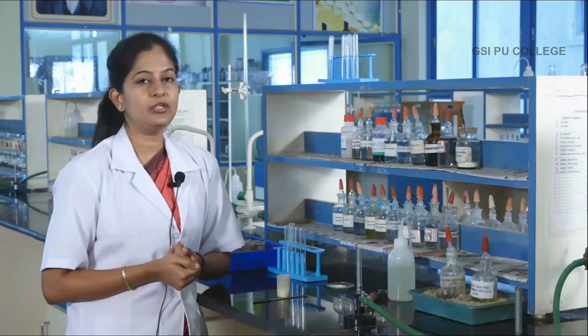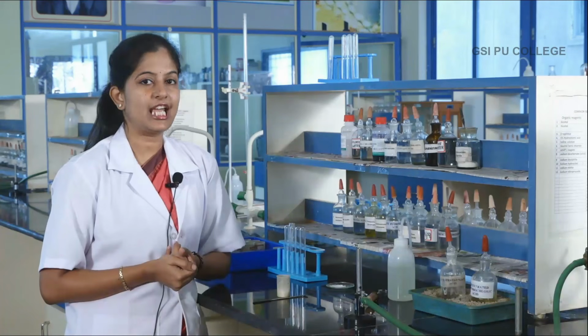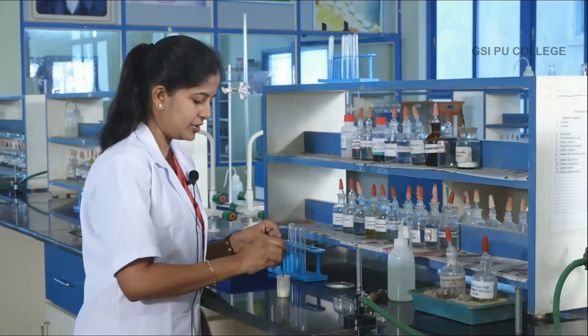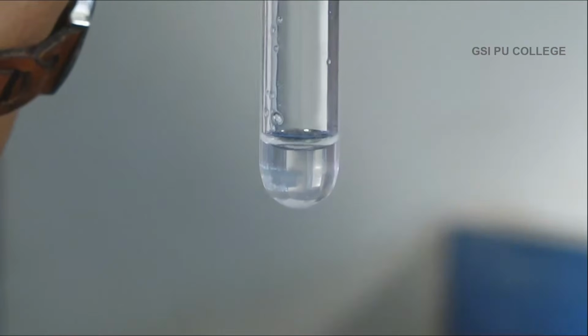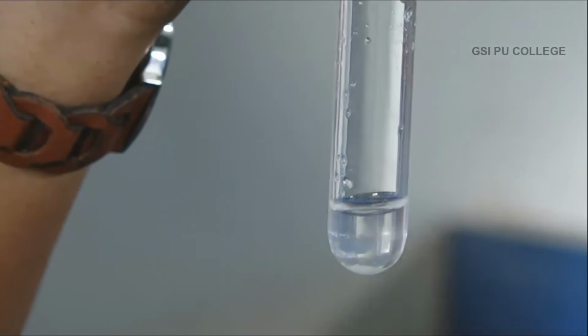Now we directly move into the analysis of acid radicals, that is, the first group acid radicals. The group reagent is dilute HCl. You add dilute HCl to the given salt and look for the characteristic reaction. If you get a brisk effervescence it is first group, otherwise you move to the second group. Take a pinch of salt, add dilute HCl. You can observe there is no brisk effervescence from the test tube, which means first group acid radical is absent.